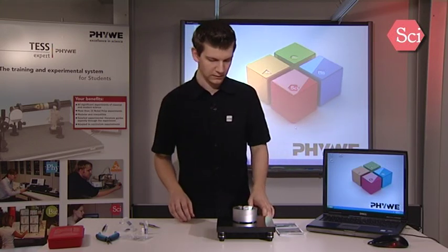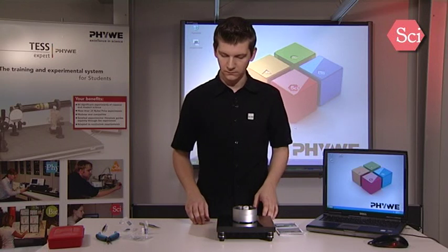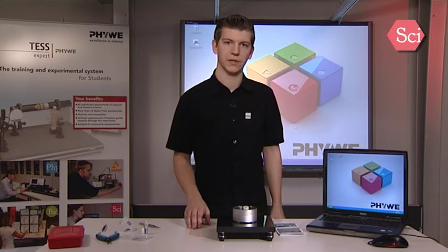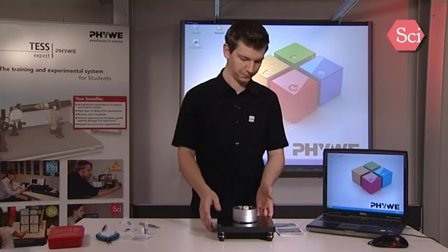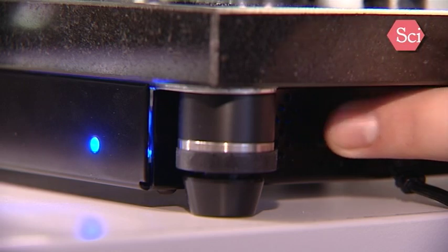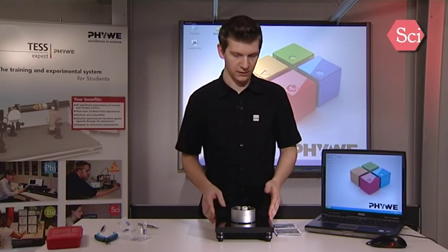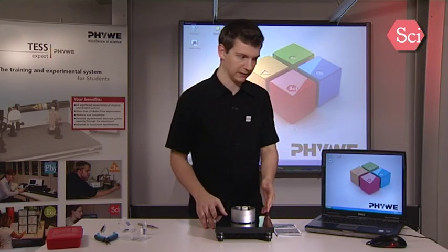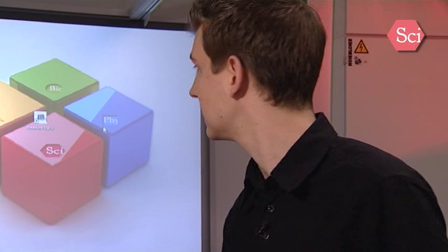We can now start up the microscope and start our first measurement with the software. It is important that you turn on the microscope just now and not before the installation process of the software is complete. We can now start with the measurement. Now we can use the software to bring the sample towards the tip. Let's start our software.